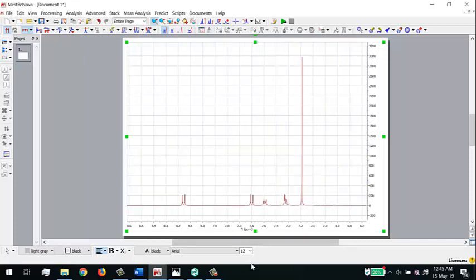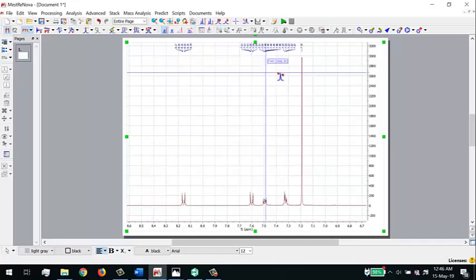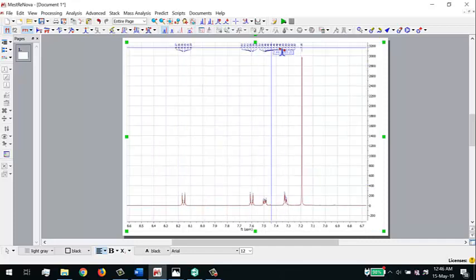Okay, now let's say we're interested in this set of peaks first. We want to select these peaks for analysis, and to do this we go to peaking, manual threshold, and we can threshold to the peaks that we are interested in. Right off the bat, we can see a few numbers pop up.